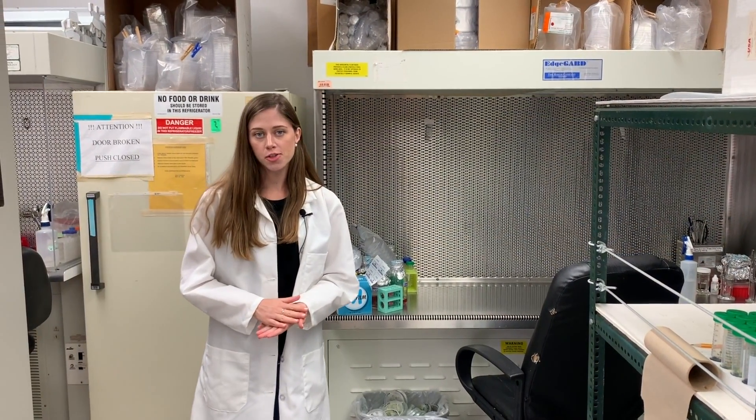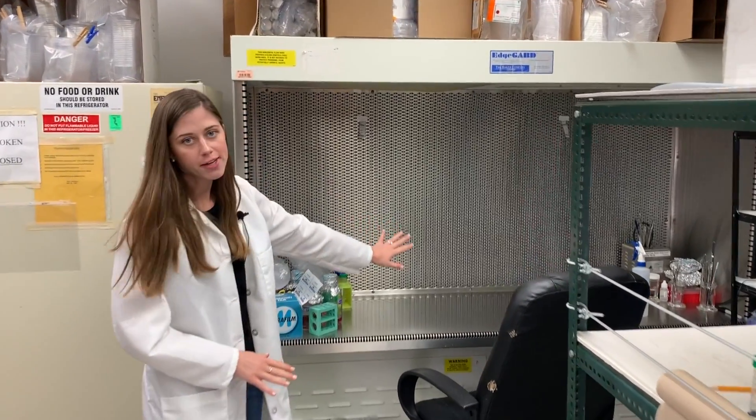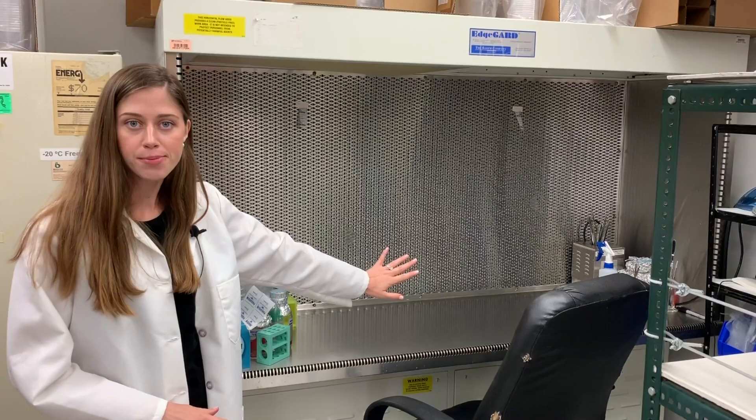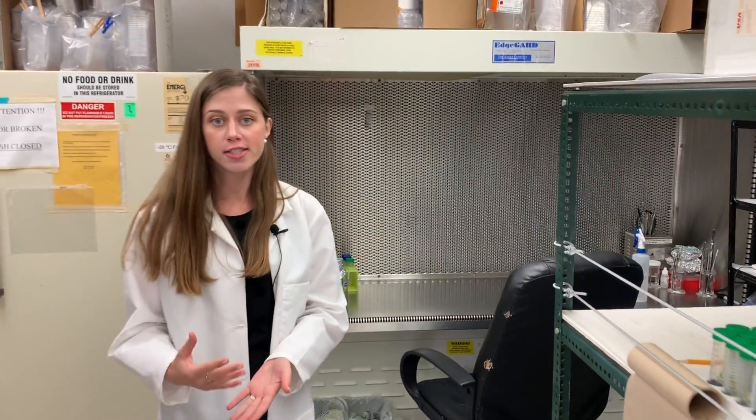In here is our tissue culture and bacterial systems. Here's our hood where we keep everything aseptic and clean in order to work with bacteria or with very sterile samples.